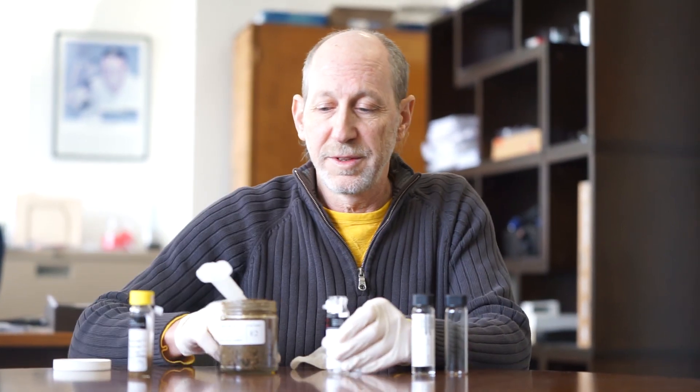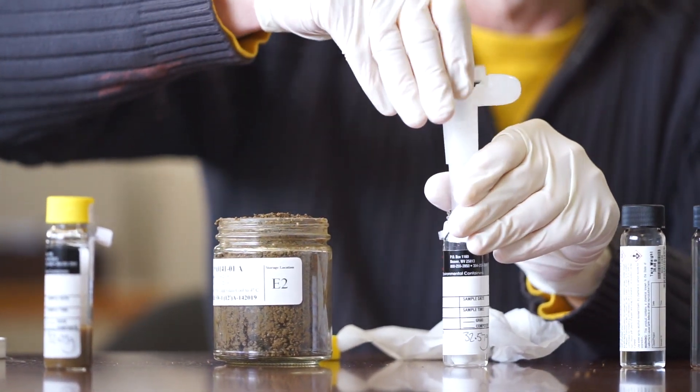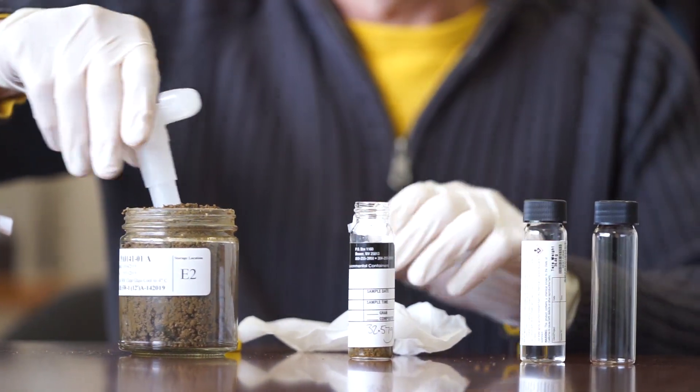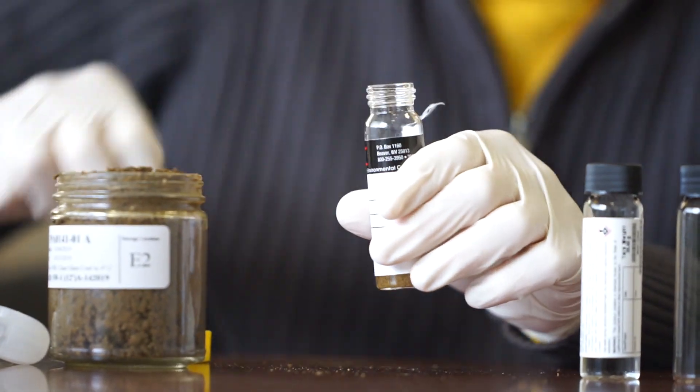Your second vial with DI water — dirt into the vial, turn, push — 5 grams. Wipe off the cap and seal it.